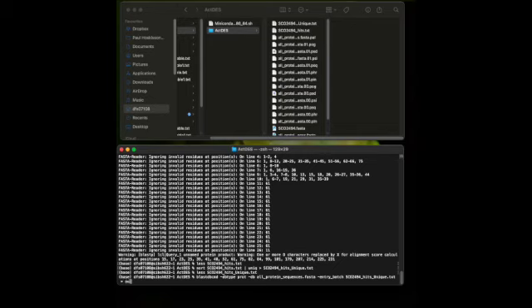the output, we'll call this SCO 2494 underscore hits underscore unique. Okay, but at this point we'll call it a FASTA file. This should then pipe that out as a FASTA file.